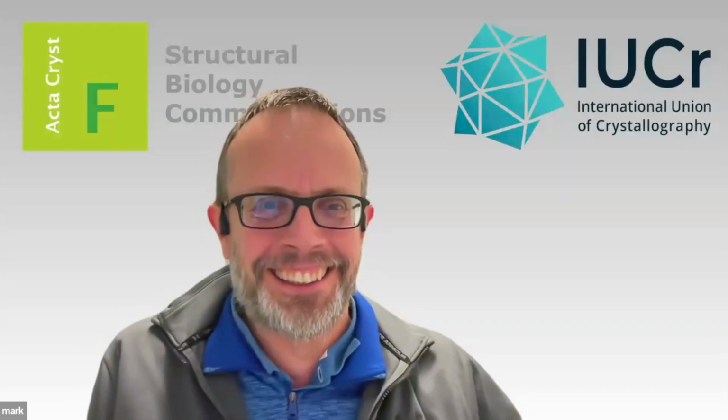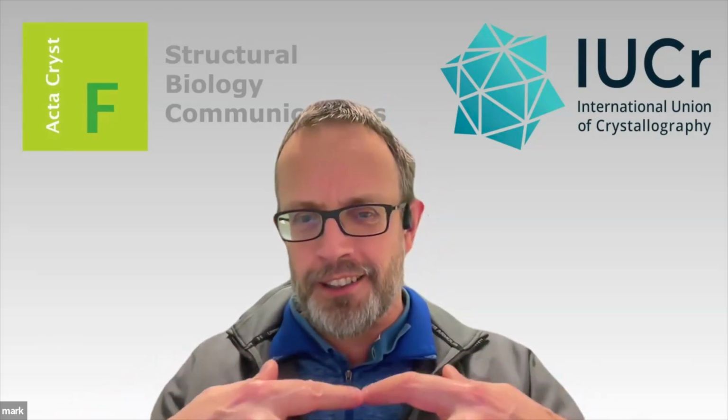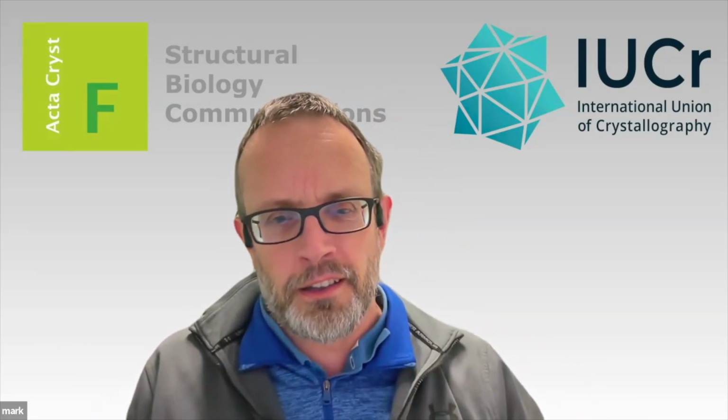That was an important part I thought about, where you distinguished between the kissing Fabs, because you had a dimeric, well, contaminant is not the right word, you had a fraction that was dimeric. And you ruled out on the basis of SAXS and maybe some other experiments that I didn't understand completely, that they were not the kissing Fabs interacting with each other partly through the glycans, but that there was some kind of strand swapping between the Fabs. I was wondering if you could explain that a little bit more, how you could really rule out one and not the other.